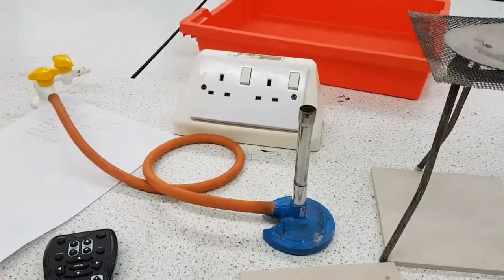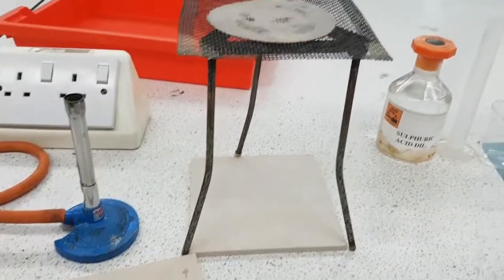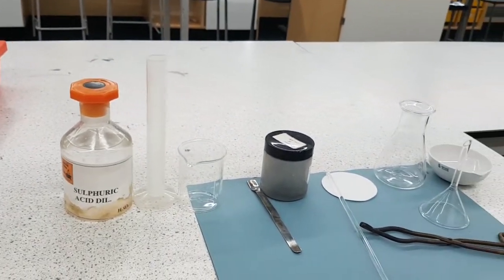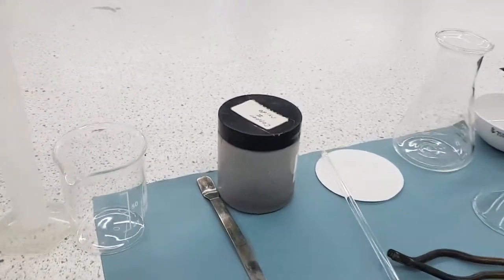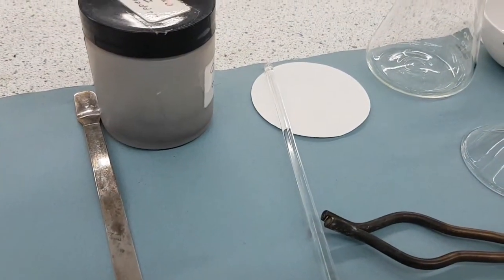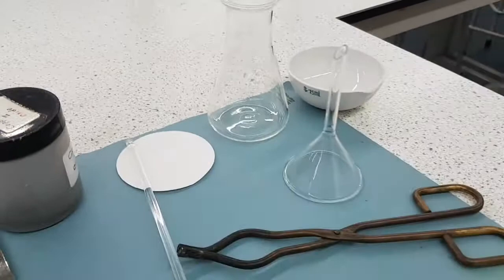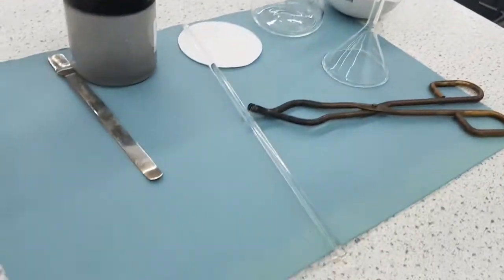For this experiment you're going to need a Bunsen burner. I say get two heatproof mats — you'll see why later. A tripod, a gauze, one mole of sulphuric acid, a 25 ml measuring cylinder, a 100 ml beaker, a spatula, your copper 2 oxide powder, a stirring rod — I forgot what it's called — your filter paper, your conical flask, your funnel, your tongs, and an evaporating basin.